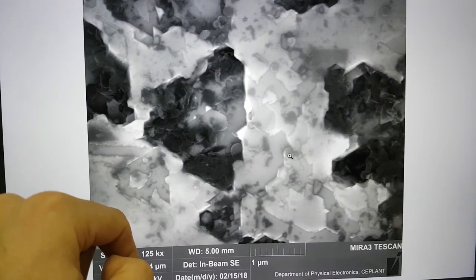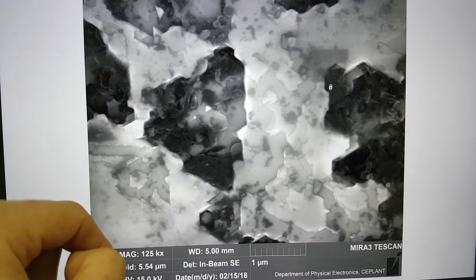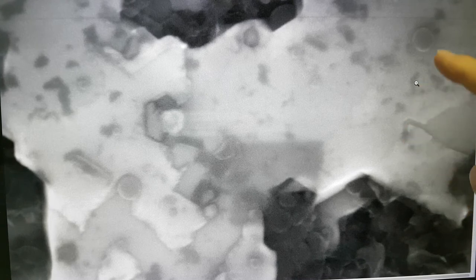You've got something that looks like it's mined here and up here and then across here, and it's been met by something that's come across from this angle and they've kind of joined into a blob. Here's another little blob in the center of a hexagon. If I come out and look over here, it's kind of like a miner channel along maybe the diamond plane.